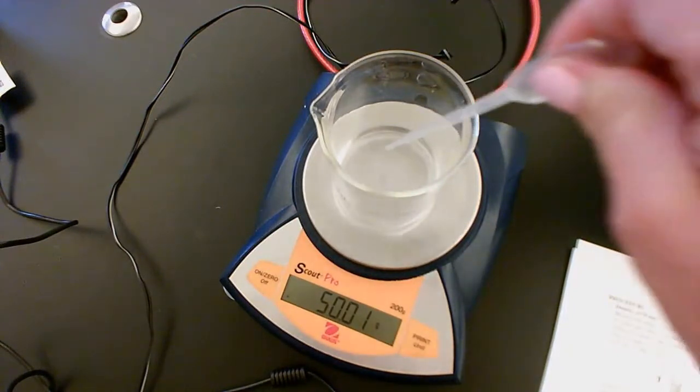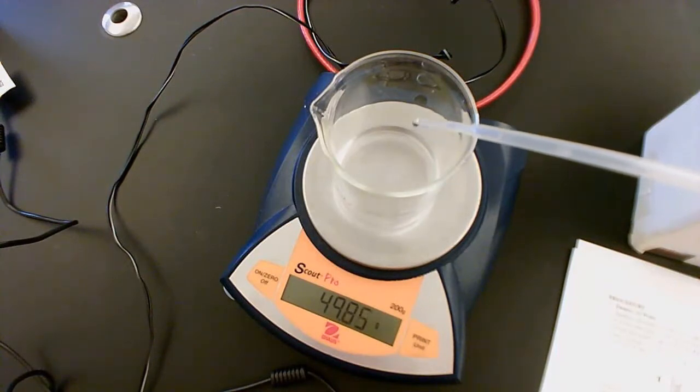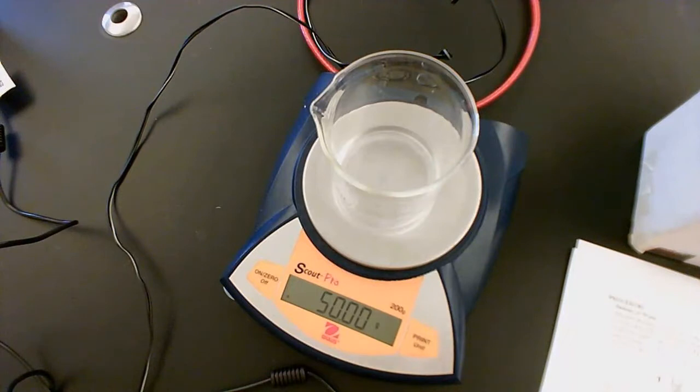If you want, let me just try to get it at 50, but I don't know if I'll be able to. There. That probably makes you happier, right? So we'll leave it at exactly 50 grams. See, you can record 50 or 50.01. This is what lab work is all about. It's iffy, give and take some.